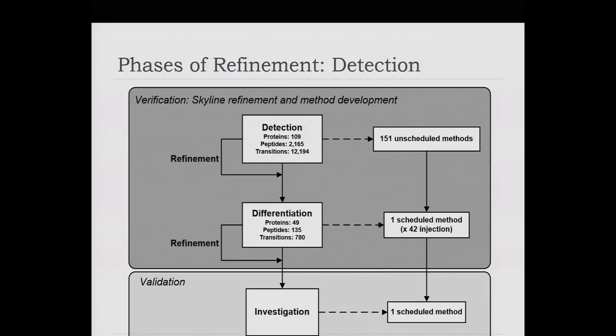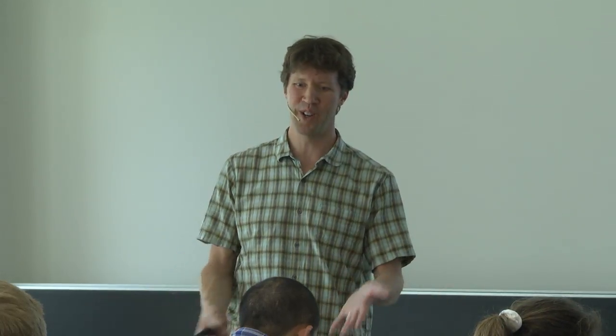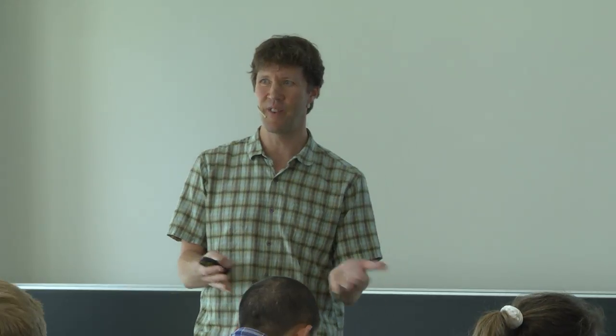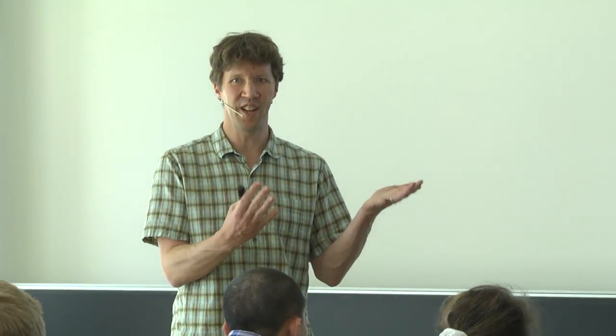So we decided we're just going to measure everything for these 109 proteins, all potential tryptic peptides, and their entire Y-ion series in an SRM measurement, and then we would come up with what seemed to be detectable. Even if we were wrong, it might turn out that when we ordered a synthetic peptide, what we thought was a detection of our peptide wasn't, but that kind of didn't matter. In the end, we generally could only find one thing that could have been a detection of our peptide, so we just kept all of those.